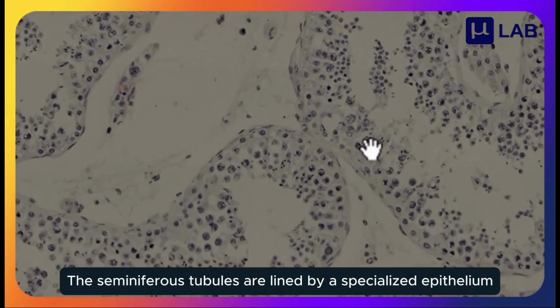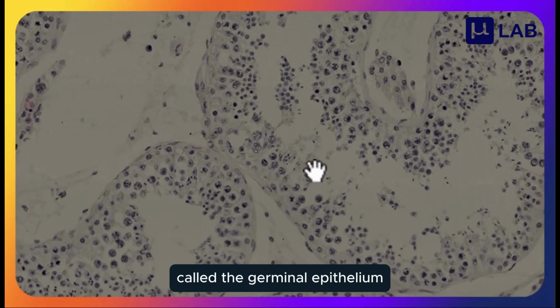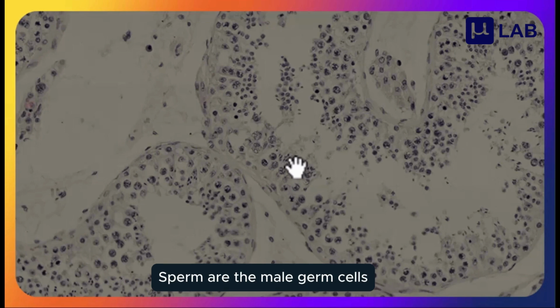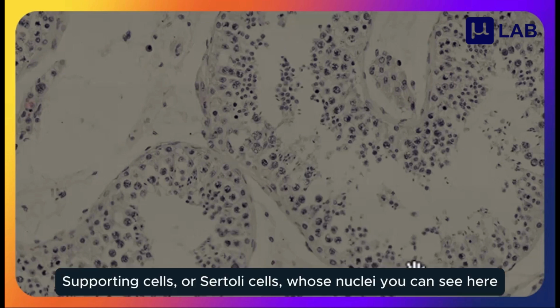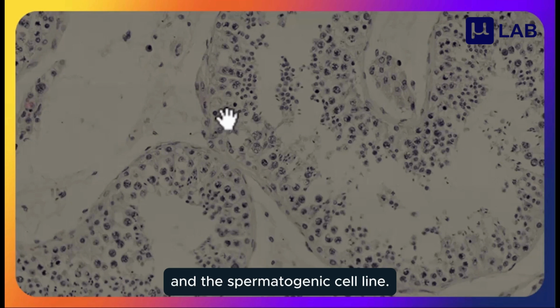The seminiferous tubules are lined by a specialized epithelium called the germinal epithelium because it plays a role in forming germ cells. Sperm are the male germ cells. The lining of the seminiferous tubules is made of two types of cells: supporting cells or Sertoli cells, whose nuclei you can see here, and the spermatogenic cell line.